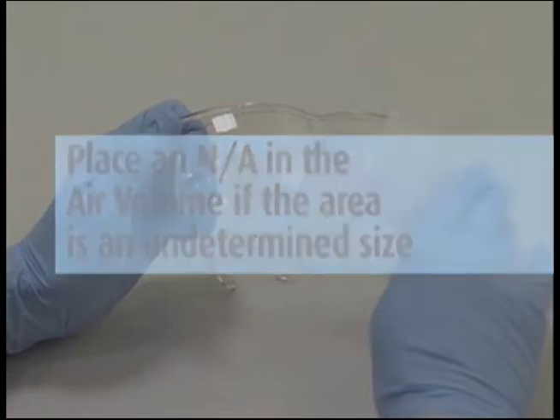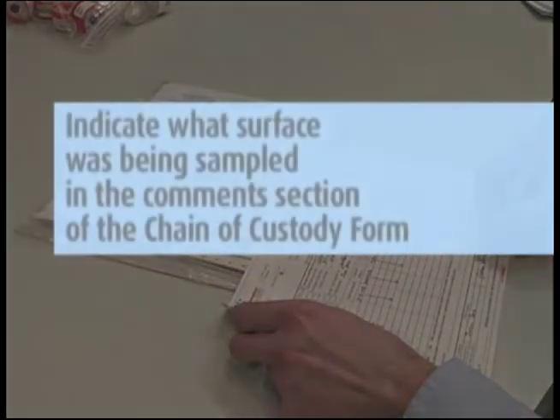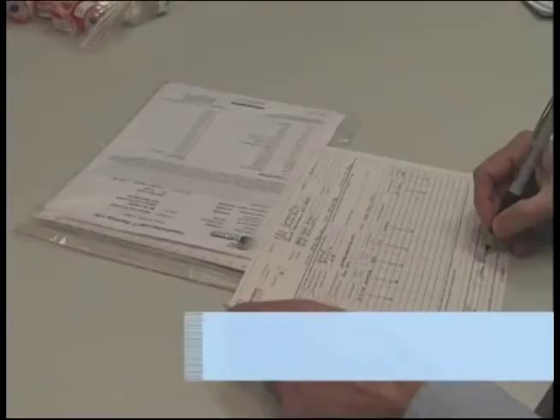Please indicate what surface was being sampled, such as table, floor, equipment, skin, etc., in the comments section of the chain of custody form. Remove the pink copy and keep this for your records.